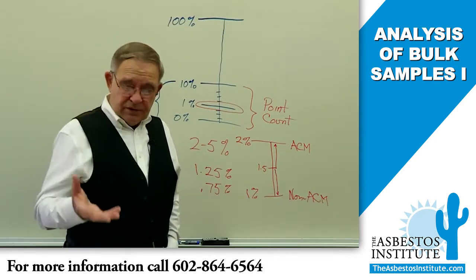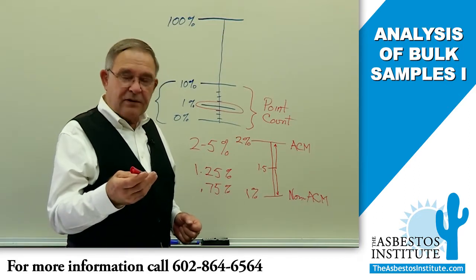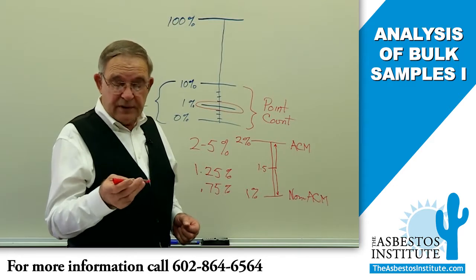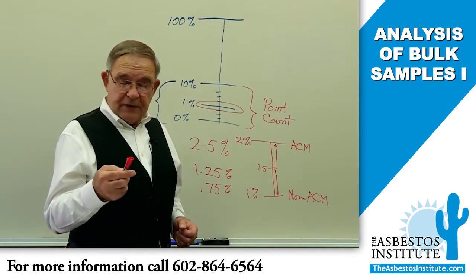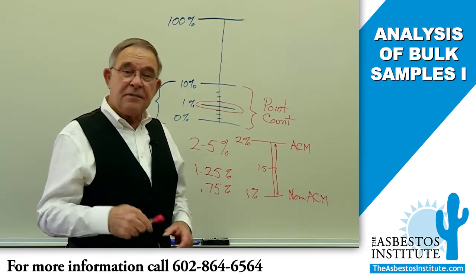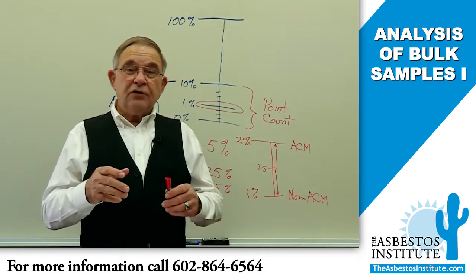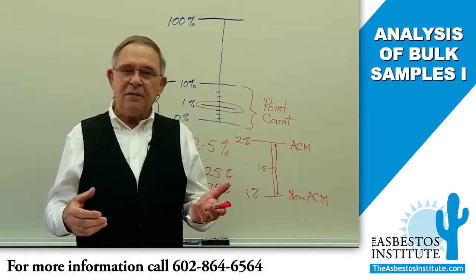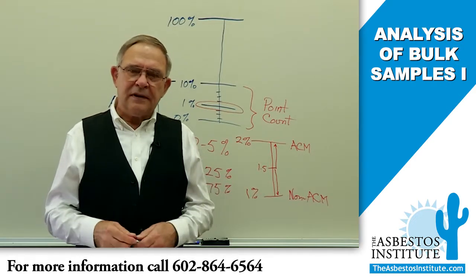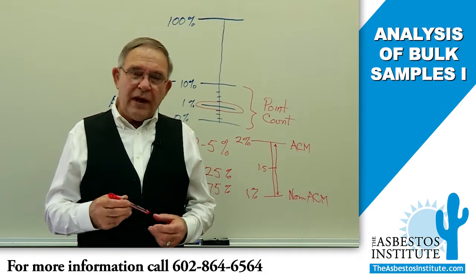Okay, the reduction, gravimetric reduction, meaning we're going to weigh this sample to start with. We know exactly what it weighs in the laboratory, and then we reduce it through several regulatory steps. One would be to ash it or burn it or cook it at a very high temperature and end up with a pile of ash instead of a sample like this. So we ash it and then weigh the ash.